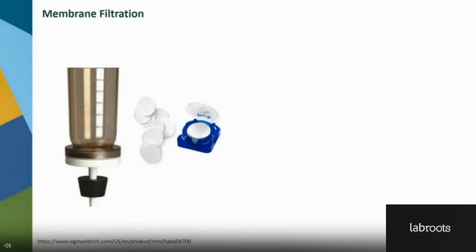An application of the membrane filtration method is to filtrate 100 milliliter of lake water sample using the 0.45 micrometer pore size filter for bacterial pathogen or fecal indicator detection.